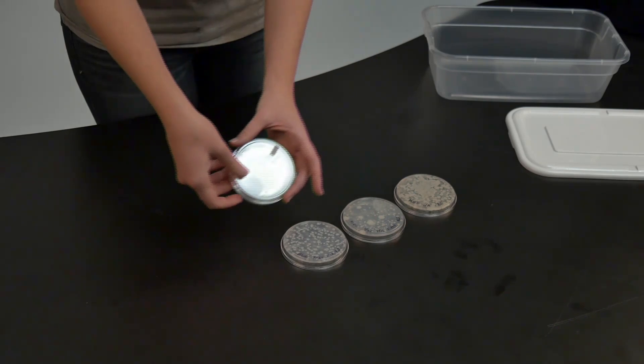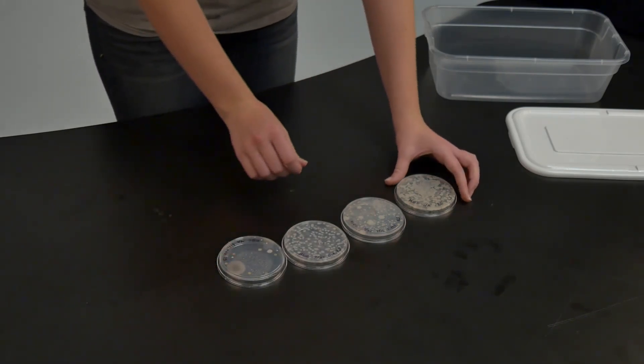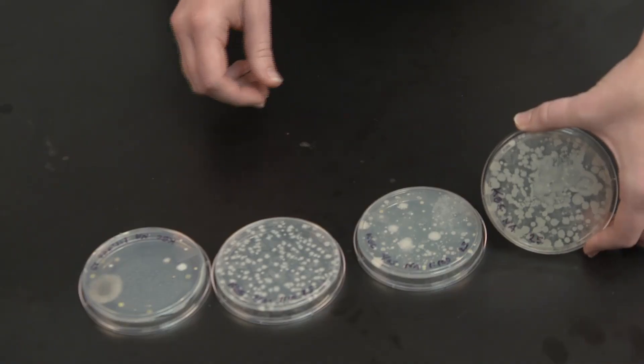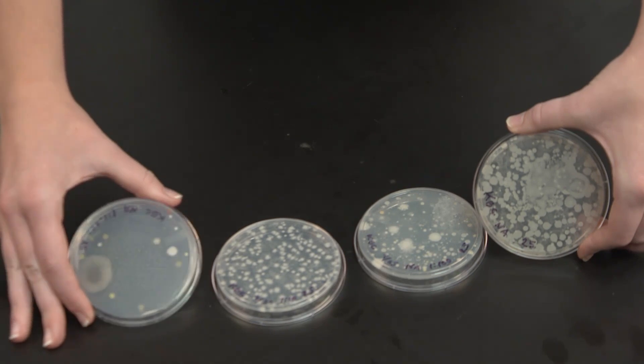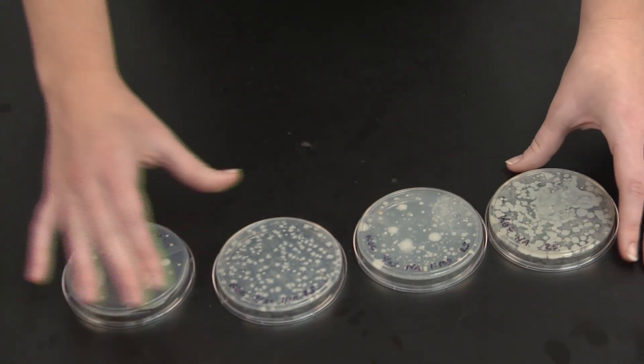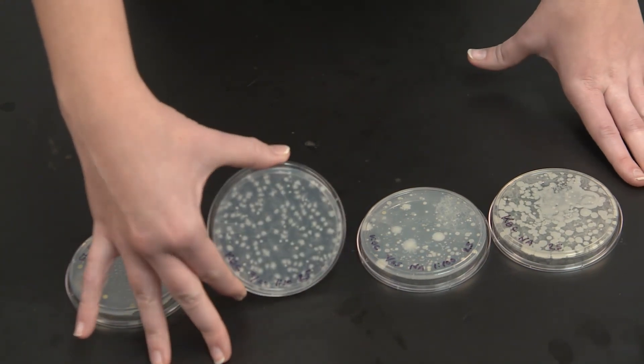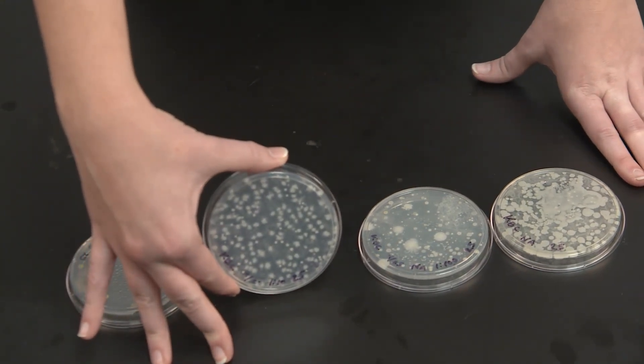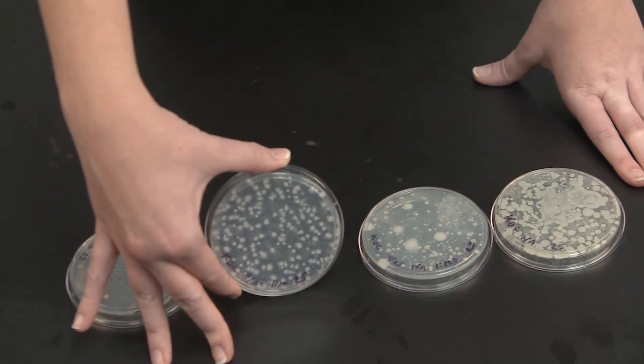Because of the dilutions that we used, you will notice that some of your plates will have a tremendous amount of growth, whereas others will have very little growth. In order to make an accurate counting of the bacteria growing in your soil sample, we ask that you choose a plate that has between 30 and 300 colonies growing on it.